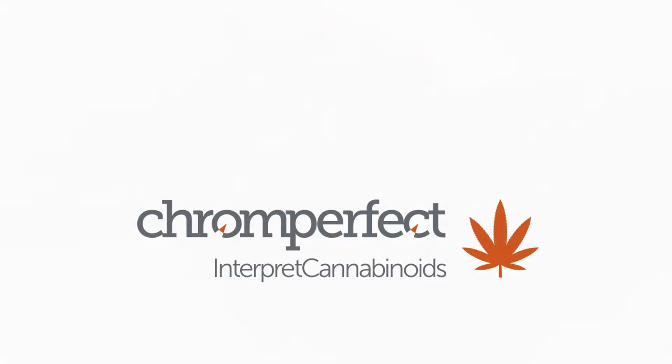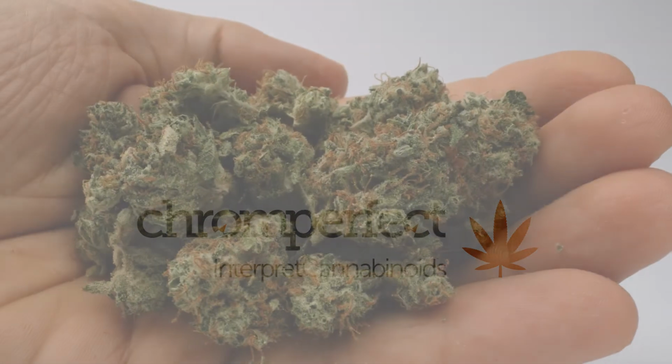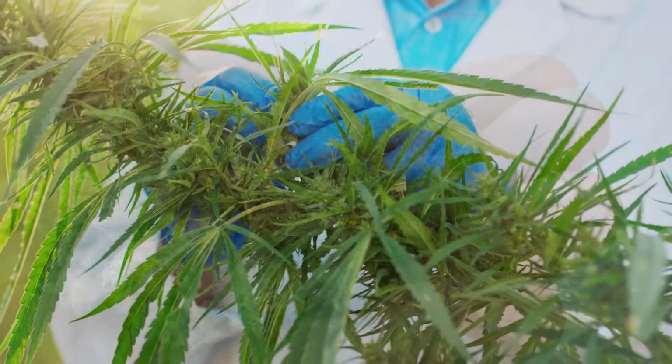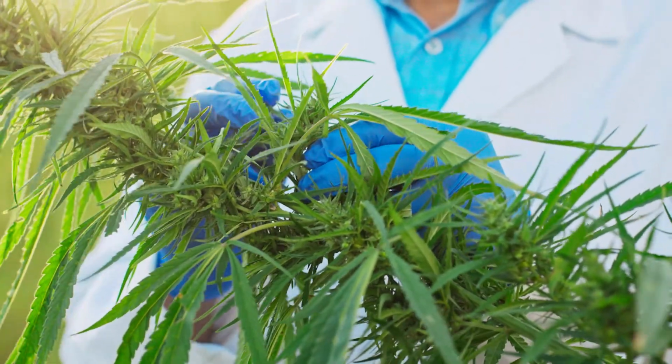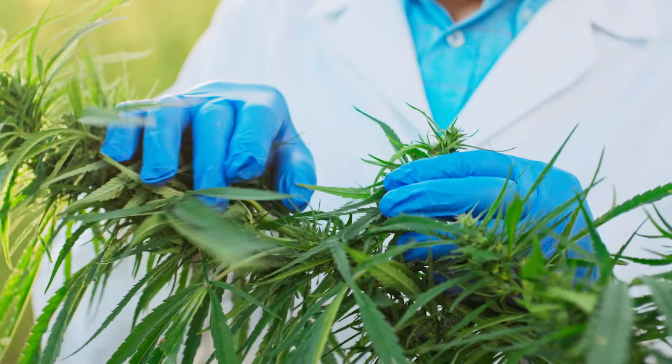InterpretCannabinoids. Fast, intuitive, automated data analysis software for Cannabis Laboratories. InterpretCannabinoids is a new chromatography data system from Chromperfect. It has been designed specifically for data acquisition, analysis, and reporting of chemical cannabinoids within samples from cannabis plant material.